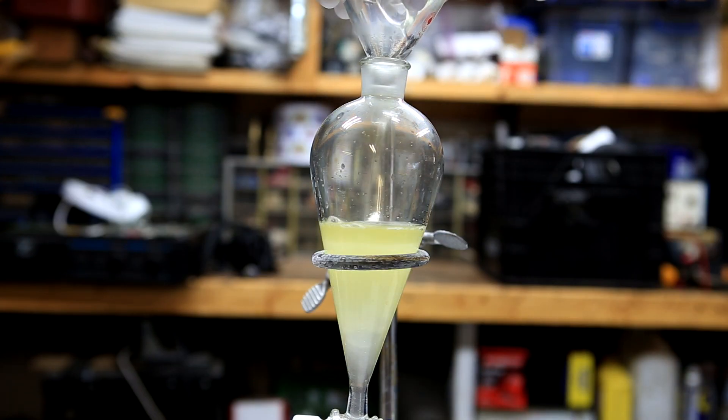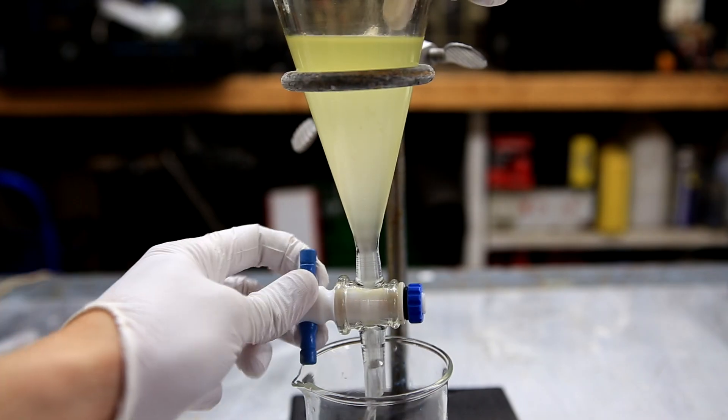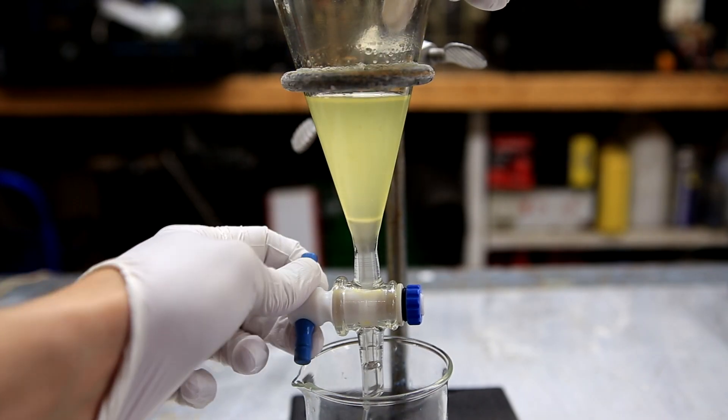The contents of the round bottom flask was then poured into a separatory funnel. The lower layer which contains the acids is drained away and discarded.